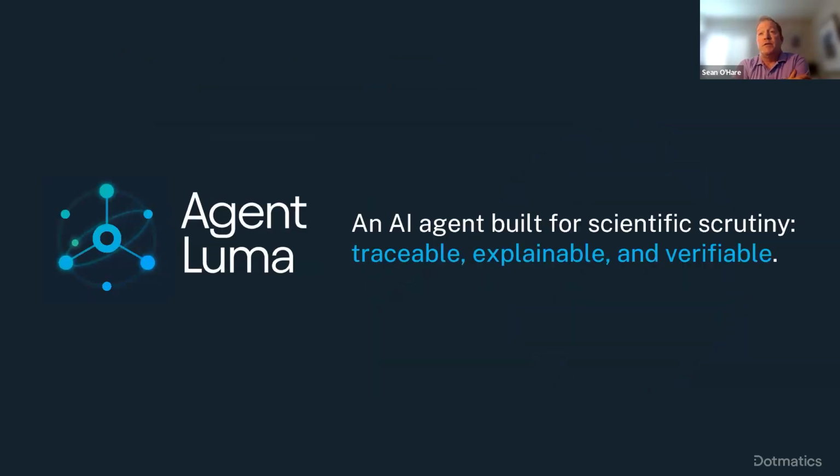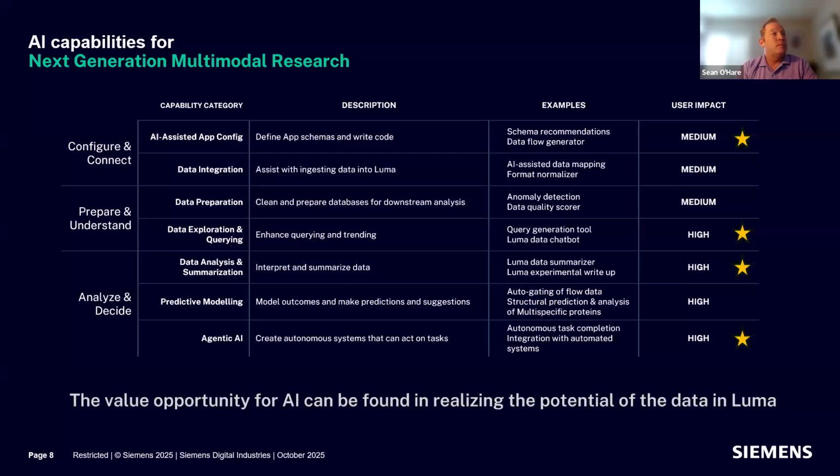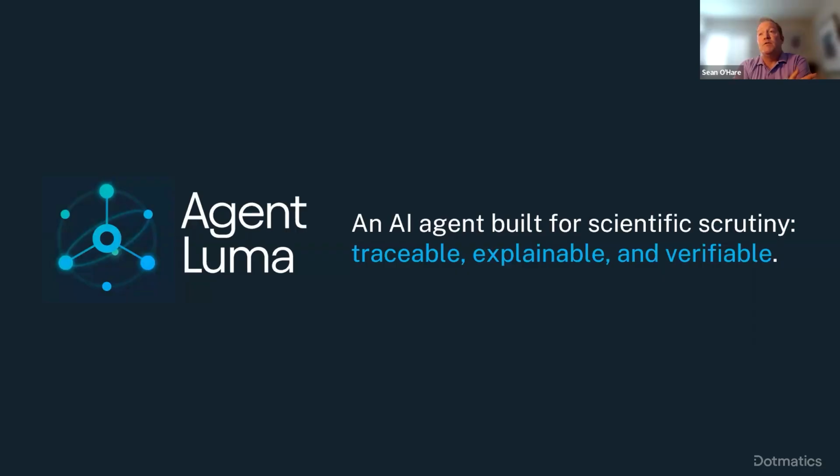Our newest addition to the Lumaverse is Agent Luma. This is our AI agent brought in using Databricks tools. And it's an AI agent built for scientific scrutiny. So the way we built Luma with the way the data are structured and held allows it to be traceable, explainable, and verifiable. Many of us have used things like ChatGPT, and we experience on a regular basis its ability to hallucinate, exaggerate, do these various things. Luma data are structured to begin with, and it allows for less inference and more straight use of the data for modeling and AI activities.